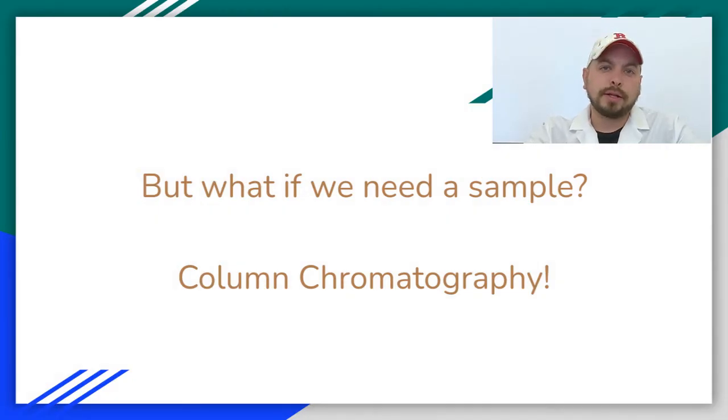So like I said, thin layer chromatography has benefits of being able to identify the purity of a substance and also understand the different components of a substance. However, sometimes we need to actually get a sample or purify a compound down into its component parts. This is actually often used in medicine, in the food industry, and very frequently needs to be really well maintained and managed. We need a very pure sample in order to be food grade or medical grade.